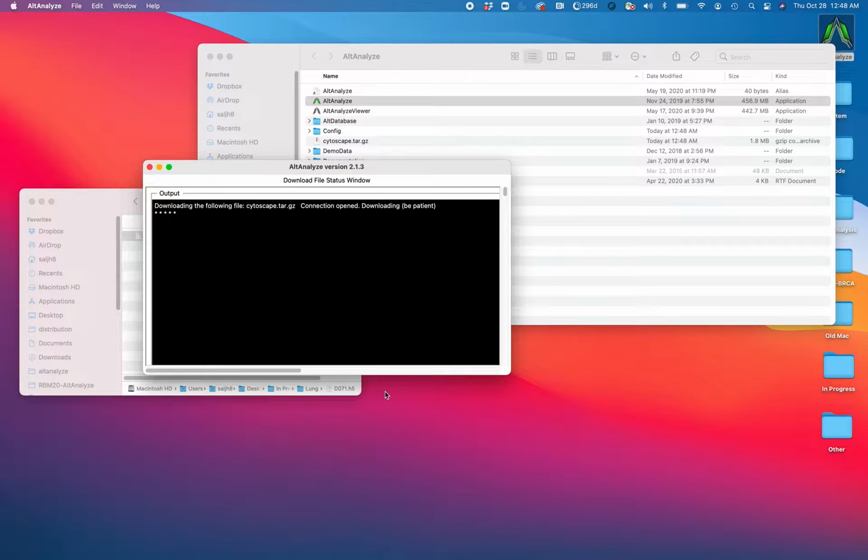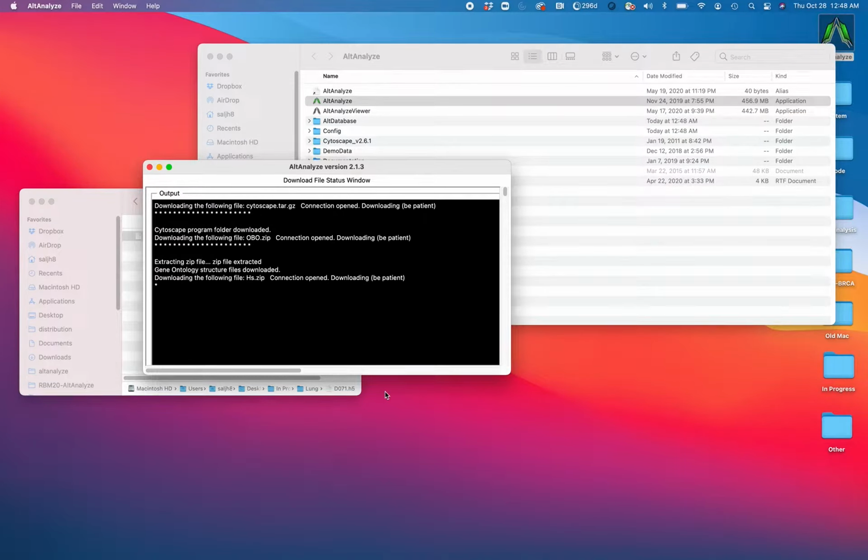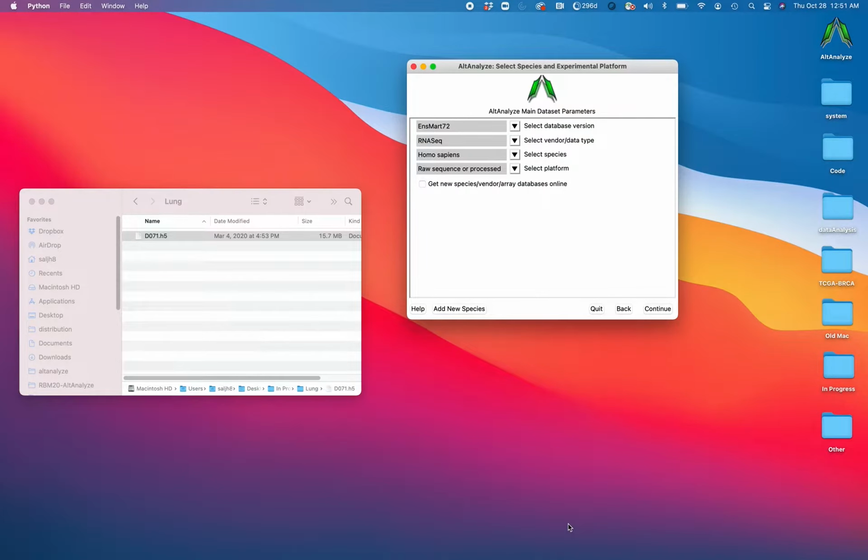Once this is complete, you can proceed to the next step, in which we'll import that H5 file and process it in the software to generate unsupervised clustering results, annotate those clustering results, and visualize the output of the program in various ways. As soon as the database has completed installation, you'll be ready to analyze your 10x Genomics dataset.